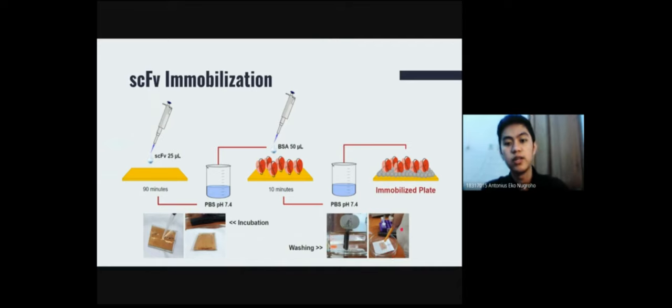And after that, we drop about 50 microliters of BSA or Bovine Serum Albumin and let it rest for about 10 minutes. And we wash it again and dry it using the same methods for creating the immobilized plate as shown in this slide.